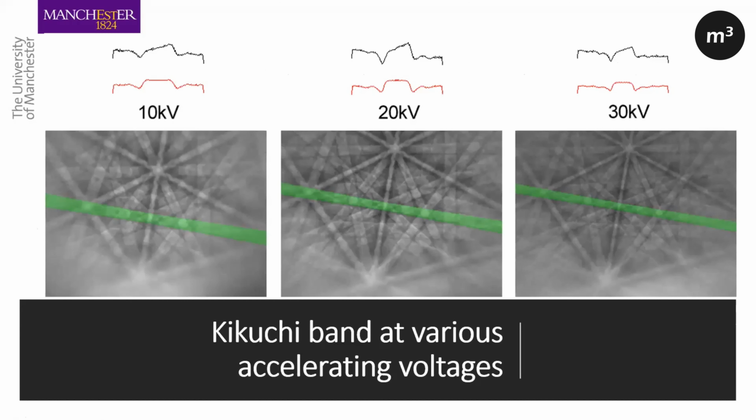That's one thing, that one can change the tilt angle, and you have an option to do that, but also the voltage. So the higher the voltage, the narrower the bands. You can see the same patterns here of, sorry, this is of iron, I think, where you can see the bands are narrower; the same band at 10 kV is wider.